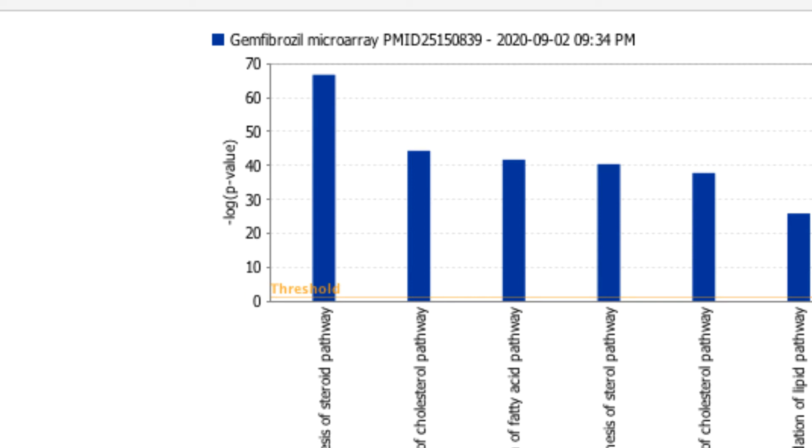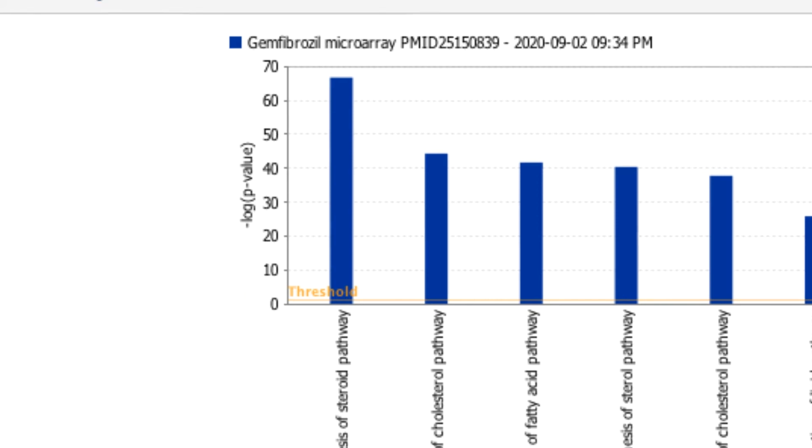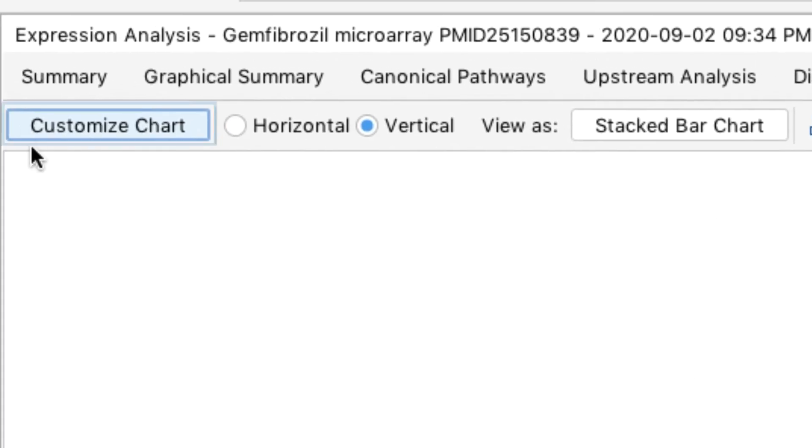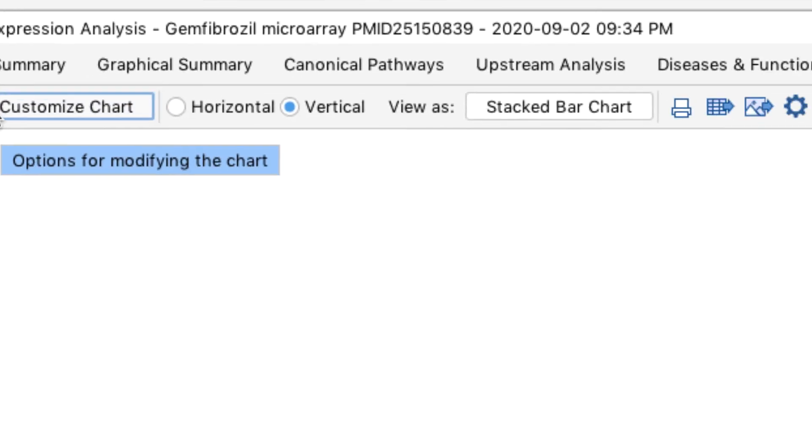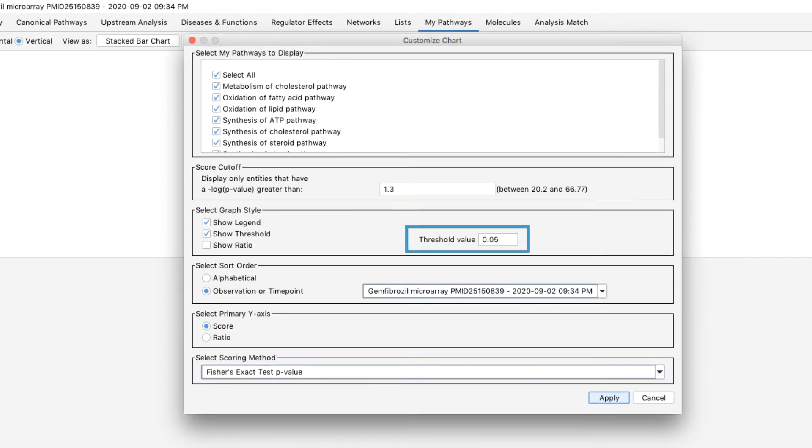If a pathway of interest does not appear in the results, you can go to Customize Chart and reduce this threshold.